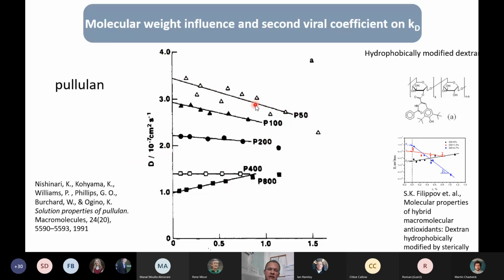And again, some people might be confused by that. The software provides the users with the value of hydrodynamic radius, and they measure a series of concentrations and see that the hydrodynamic radius is changing. They say, "Oh, look, my particles are getting bigger or smaller, so I have some kind of new phenomenon." But this is not true. What they actually observed is just the concentration dependence of the diffusion coefficient, right? And it's not related to the size of nanoparticles.